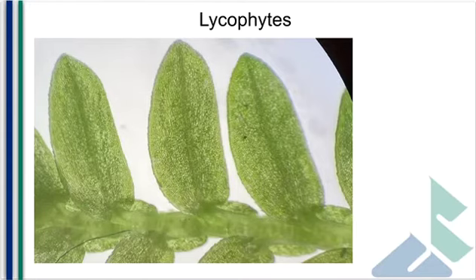Back to our lycophyte, the Selaginella, under the dissecting microscope, so that way we can hopefully see the midvein of the microphyll in more stark contrast. So here's what we're looking at, a single microphyll with a singular vein offshooting from the stem here. And this really is what defines the microphylls of lycophytes: one unbranched vein, to be very thin, with leaves of corresponding small width.